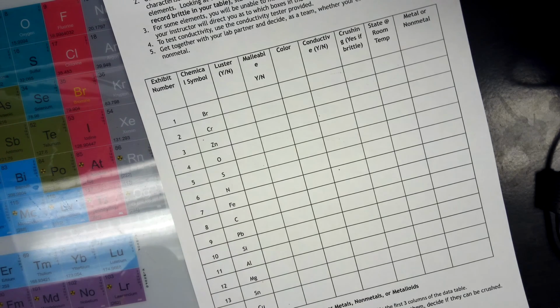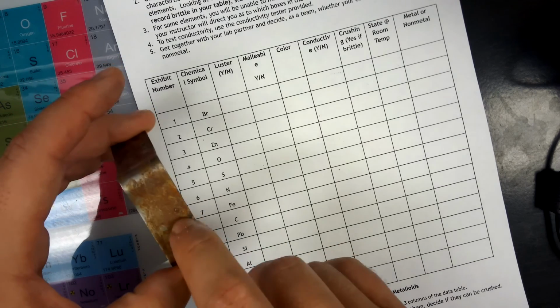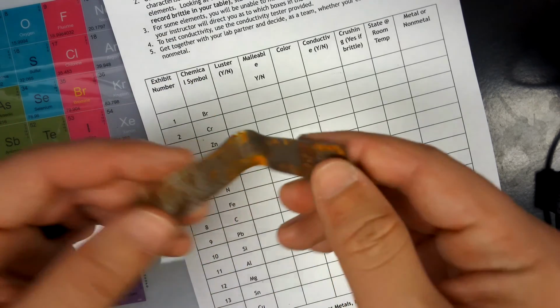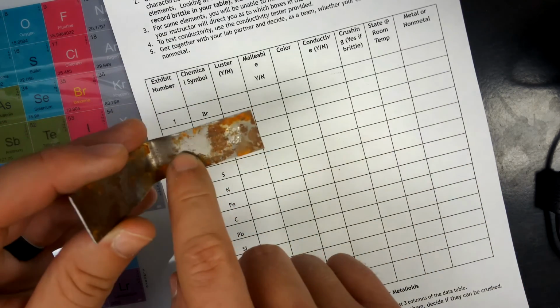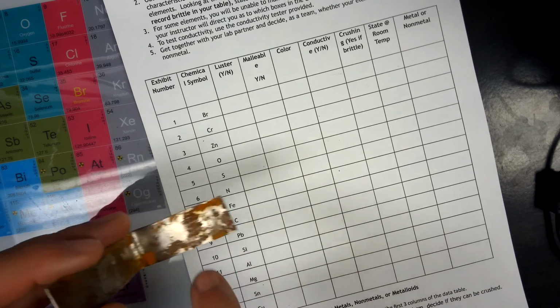Iron. Iron's another one. I keep talking about rust. Maybe you think of iron as having that rust color. That rust color actually isn't pure iron. That's iron oxide on the iron. Where you get the silver color is the iron itself. So yes, iron is shiny. It is Fe. It is malleable.